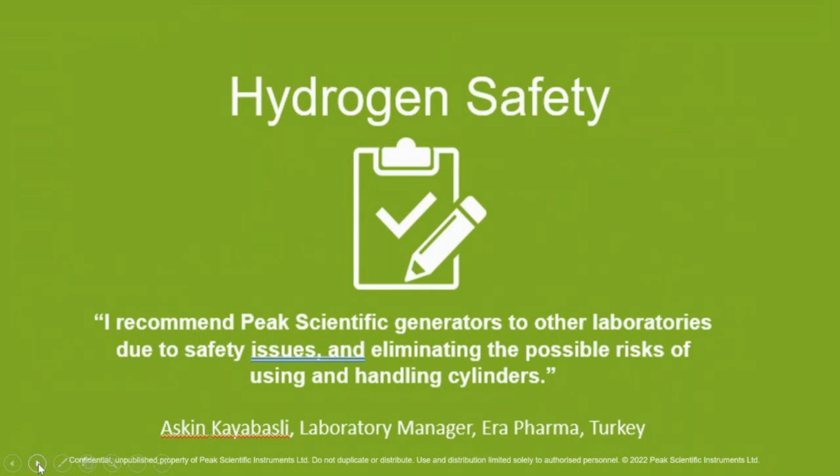So we're aware that a number of laboratories now require that hydrogen cylinders are located outside the laboratory, whereas generators can be operated within the laboratory, and we would actually encourage you to use them close to GC instrumentation to reduce the number of connections in the pipework between the generator and your GC. By having it close to the GC, you can keep an eye on the generator, make sure the deionized water's topped up, but it also reduces any risk of introduction of impurities via leaks.